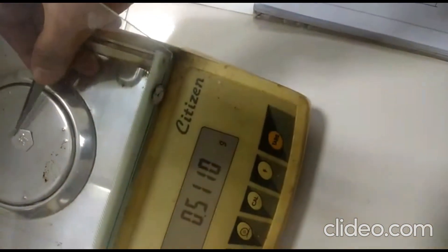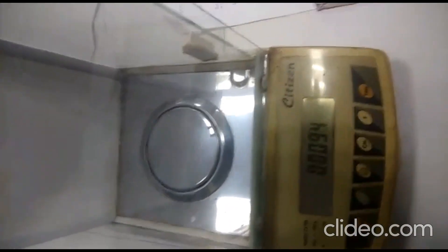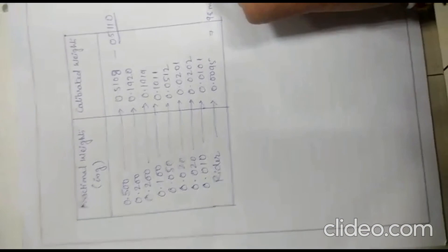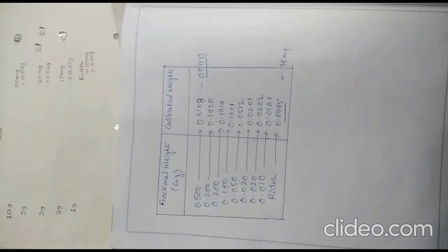I have already noted the weights of some of the fractional weights. Now I will show how we can also weigh the rider. You can see the rider here — using it we can weigh in milligrams. The theoretical weight of the rider is 10 milligram, but it is reading 0.0095 g, which is equal to 9.5 milligram. This is how we calibrate these weights, and these calibrated weights are used for further calculations. Thank you.